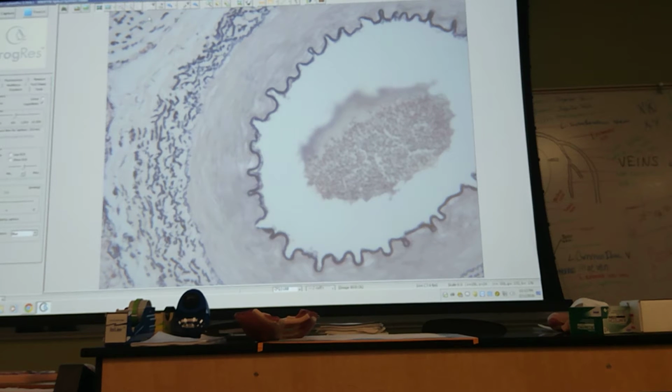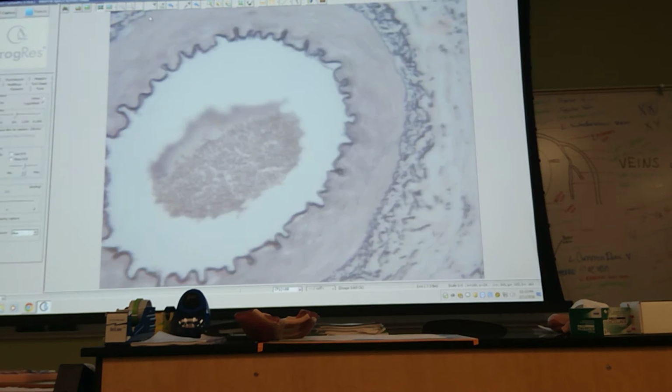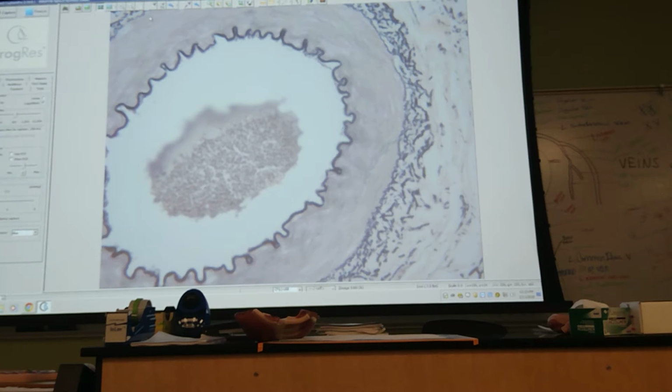All right. Then you have a middle layer. It's called tunica media. Middle. Okay? It has two parts also.